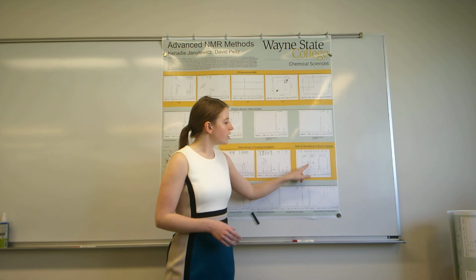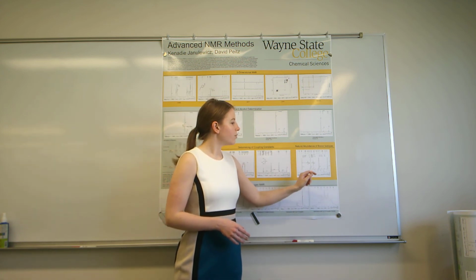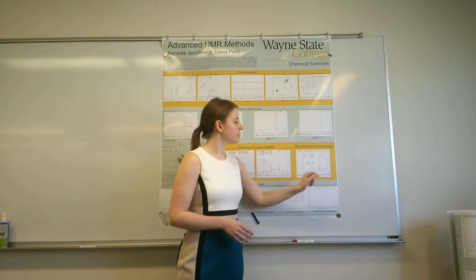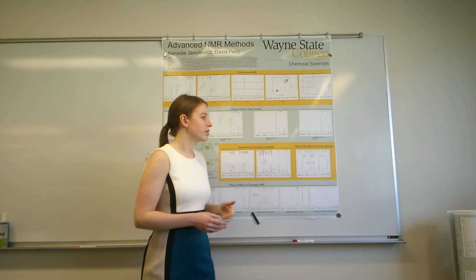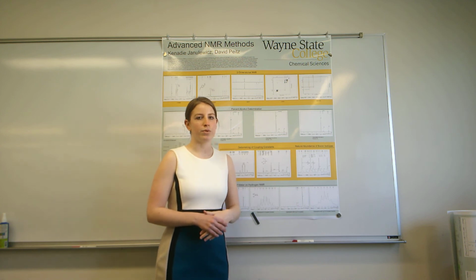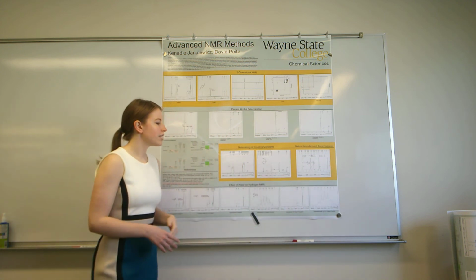Boron-11 will have a spin of 3/2, which will provide us with 4 peaks, whereas boron-10 will have a spin of 3, which will give us 7 smaller peaks. Using the areas of integration of these peaks, we were able to calculate the natural abundance, which we calculated as 78.5 and 21.5%, and it is roughly 80-20 in nature, so we were really close.